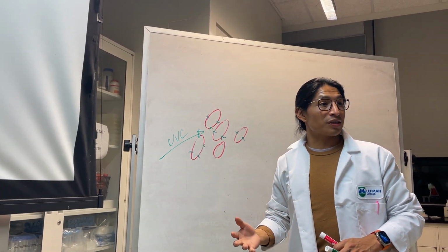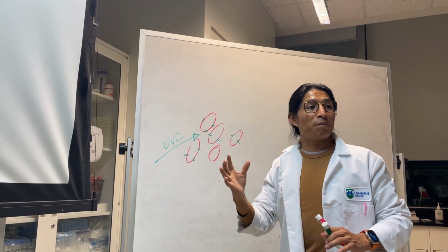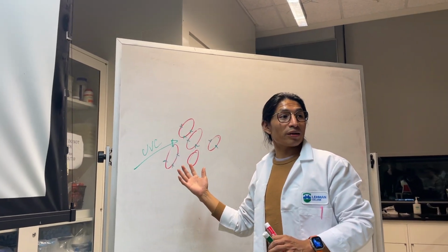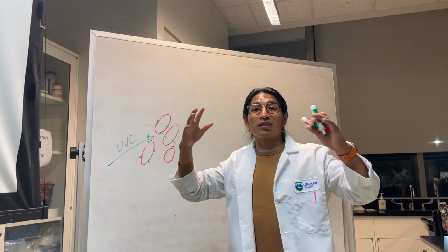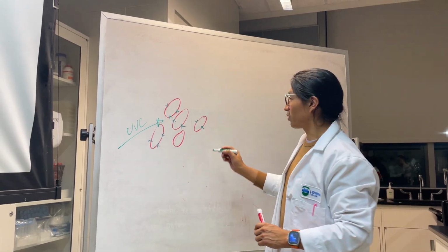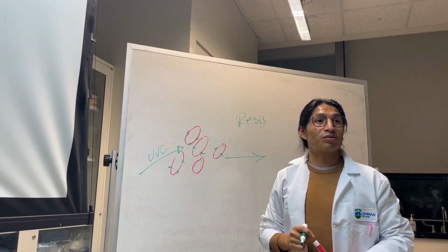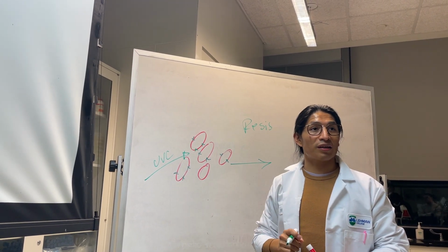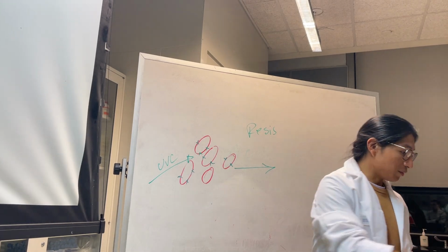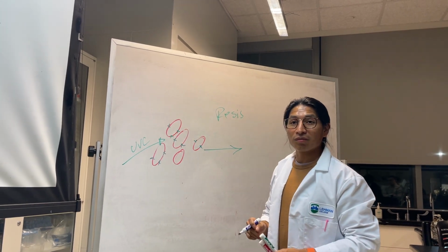And this is where I hypothesize something. I say like, UV light kills anything that is at the surface, helping any bacteria that's at the bottom underneath continue to grow, protected in some way. Perhaps by the carcasses of the bacteria that just died above. If we remember anything from antibiotic resistance, from that little slide, we know that any bacteria that's left multiplies. Not just multiplies, the cell walls are broken down.